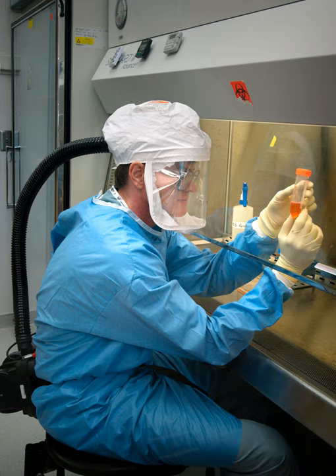Air is also exhausted through a HEPA filter, and depending on the type of Class II BSC, the air is either recirculated back into the laboratory or pulled by an exhaust fan, through ductwork where it is expelled from the building. The Type A1 cabinet, formerly known as Type A, has a minimum inflow velocity of 75 feet per minute. The downflow air, considered contaminated, splits just above the work surface, the BSC's smoke split, and mixes with the inflow.